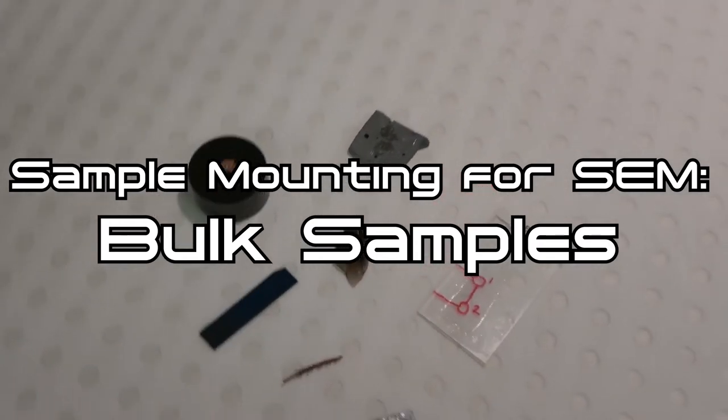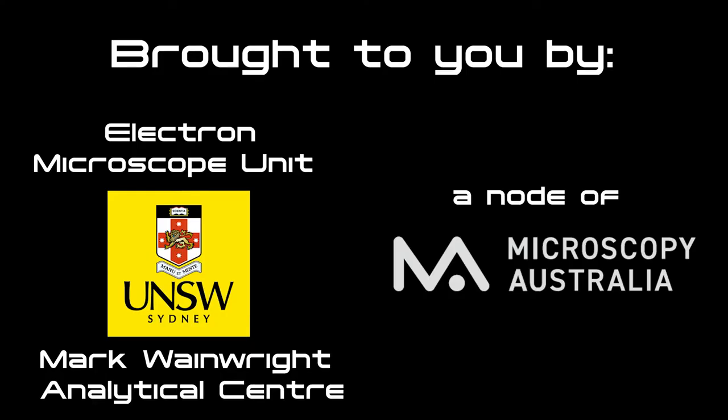Sample Mounting for SEM – Bulk Samples. This video is brought to you by the Electron Microscope Unit at the University of New South Wales' Mark Wainwright Analytical Centre, a node of the Microscopy Australia Network.